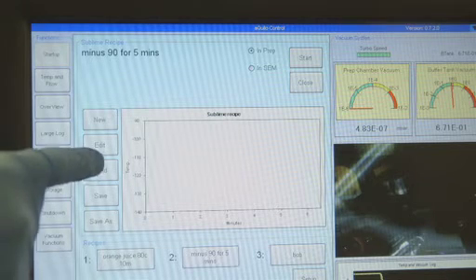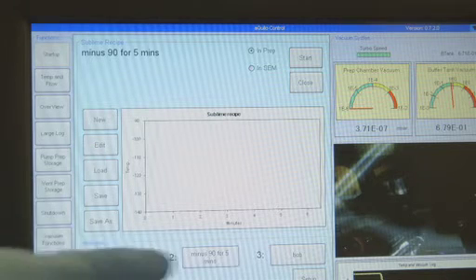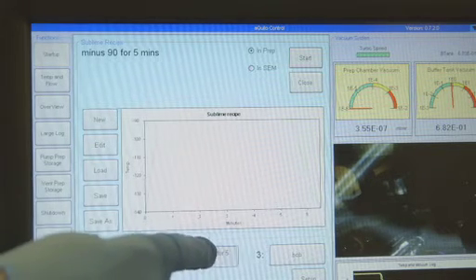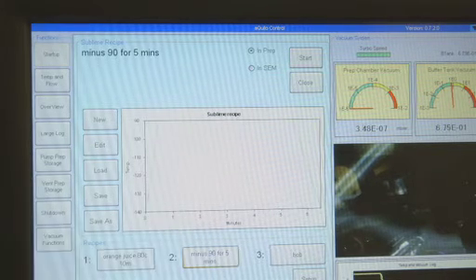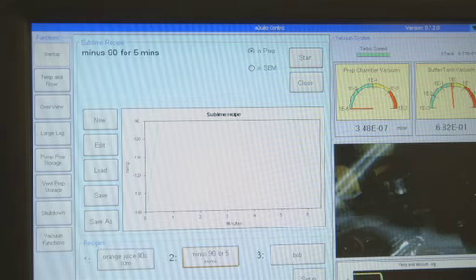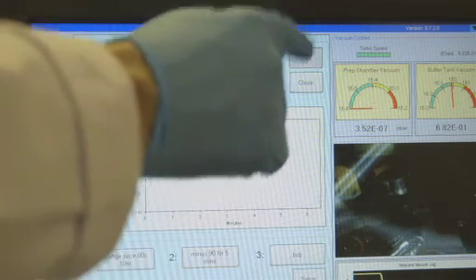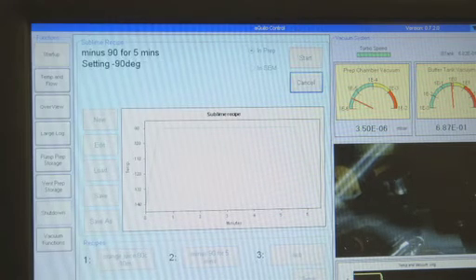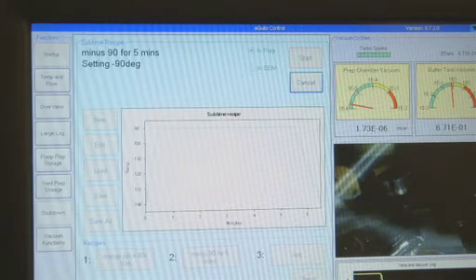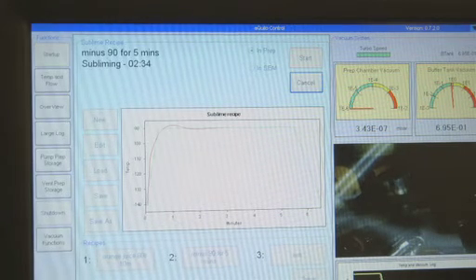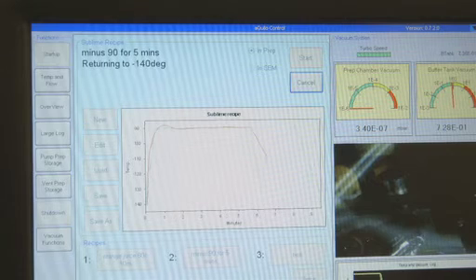Sublimation, the removal of surface ice by controllably raising the specimen temperature, is fully automatic and carefully controlled. Favorite recipes can be stored for future use.